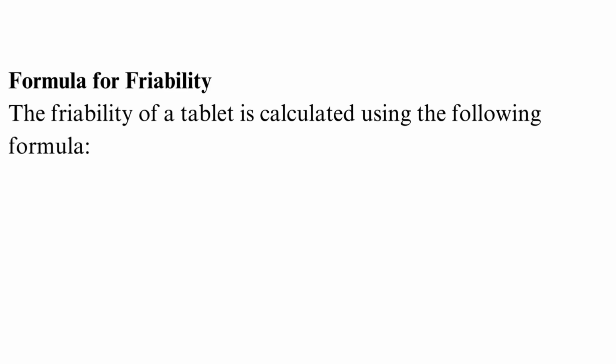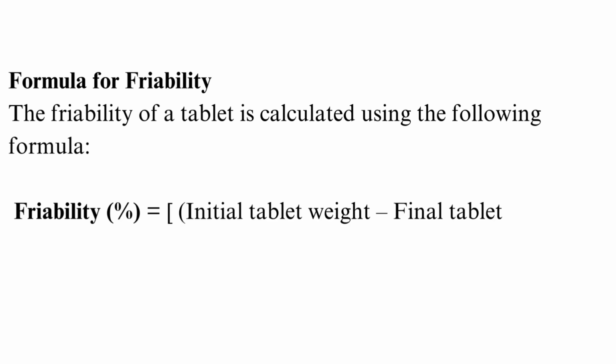Formula for friability. The friability of a tablet is calculated using the following formula: friability, %, equals initial tablet weight minus final tablet weight, divided by initial tablet weight, times 100.